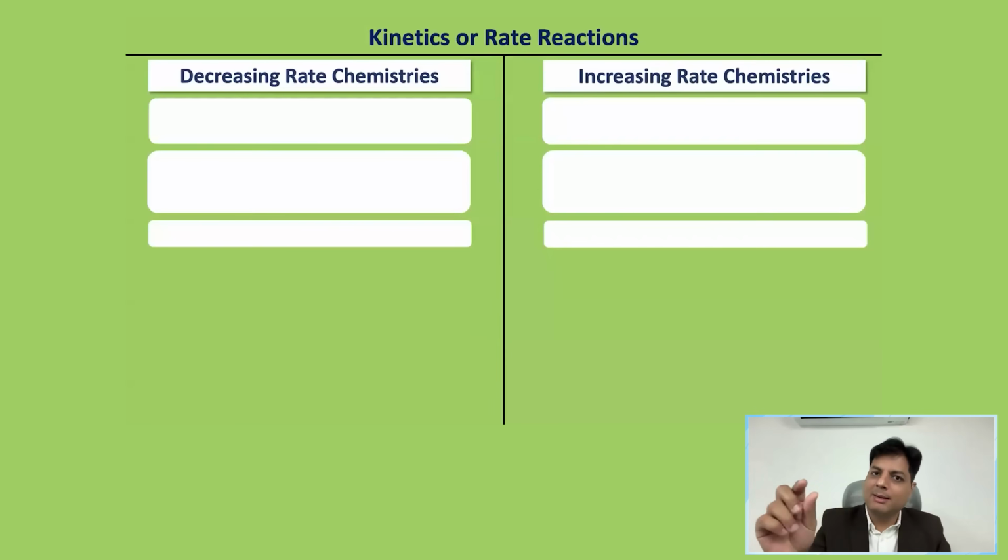Therefore, enzyme will show as low as zero activity originally before the reaction. So, unlike the endpoint reaction, we cannot wait for the reaction to get completed. Here we have to take the absorbance as and when the reaction is still progressing.